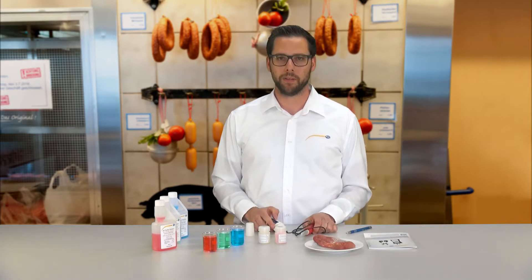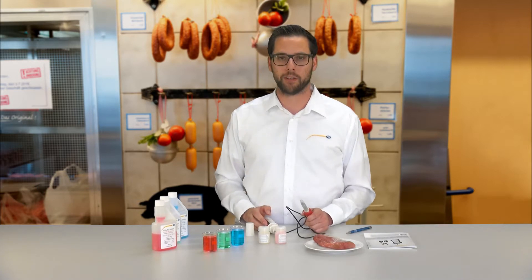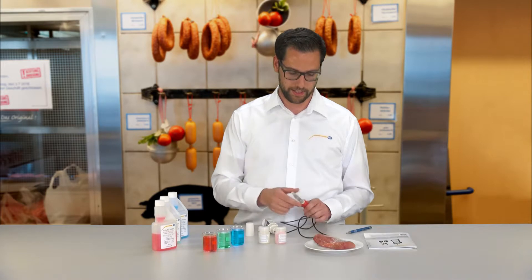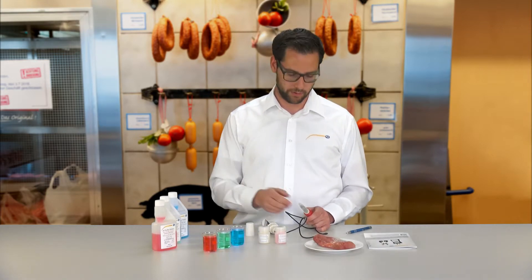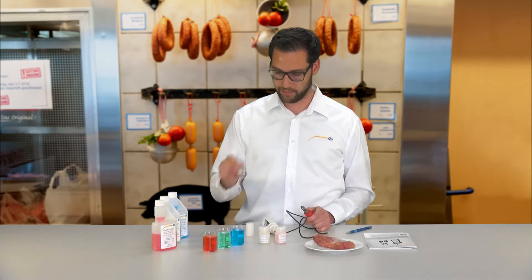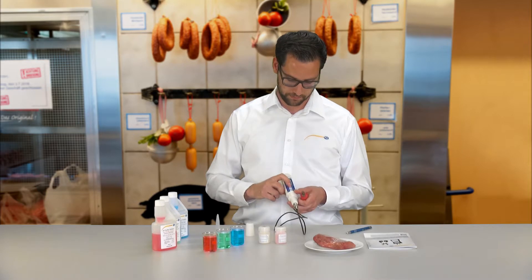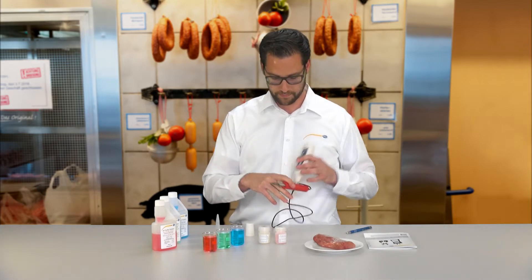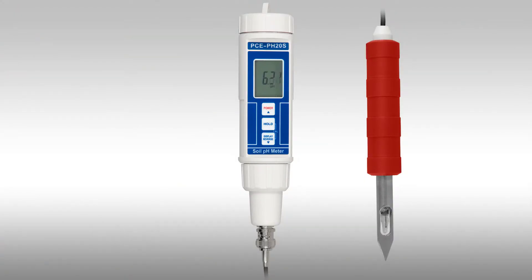Before you do a measurement with the device, after an electrode change or a long period of storage, the device should be calibrated. That means you calibrate the device using the solutions. For this, you first take off the safety cap of the electrode, turn the device on, and put it into calibration mode.